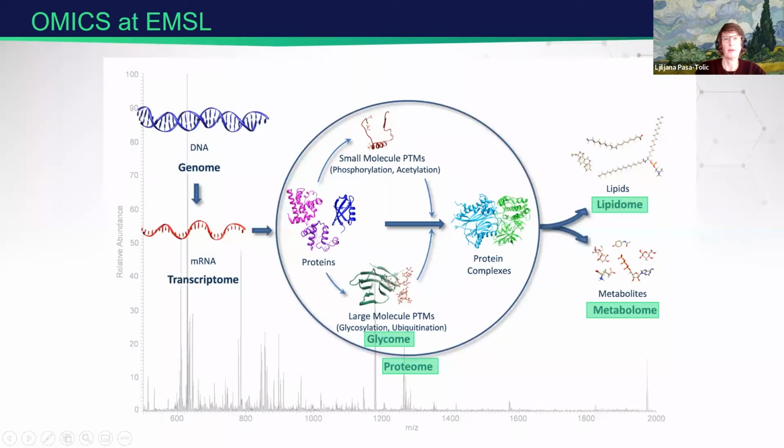Okay. So at EMSL, we are primarily focused on post-genomic measurements, so primarily proteomics and metabolomics, lipidomics. And today we will discuss the proteomics side of the equation and specifically look at the intact proteins and protein complexes.